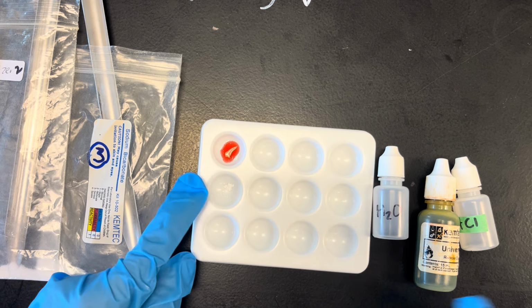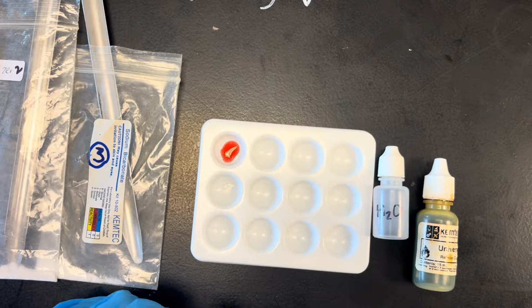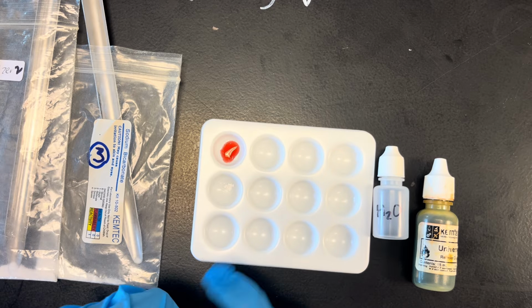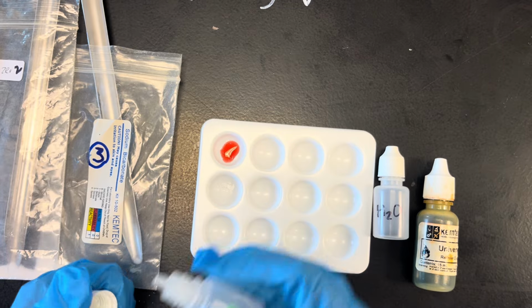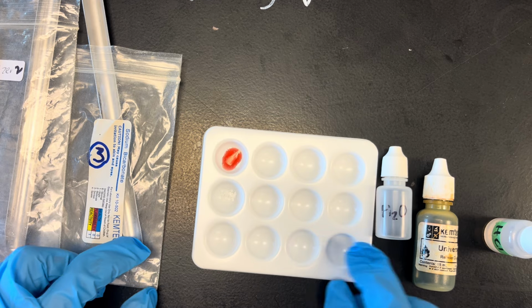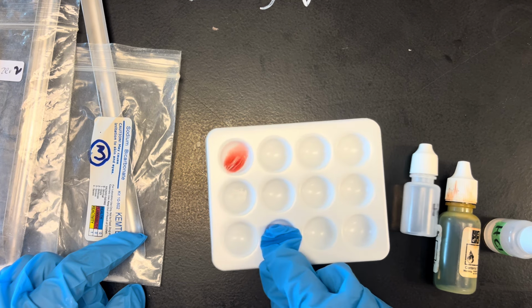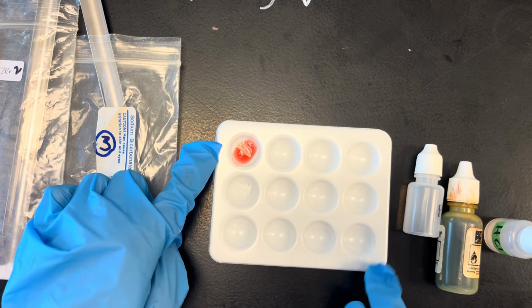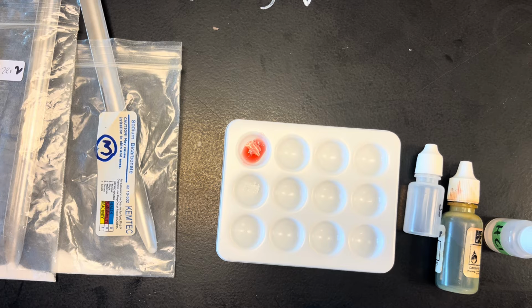And then in the second and final well, you're going to test it with acid. Keep in mind that this is a strong acid. You don't want to get it on your skin or in your eyes. Just going to add 2 drops of acid and see if it reacts. You could also see if it dissolves in the acid. If you need to add an extra drop to check, I don't mind, but this one does not look like it dissolves really well at all, either in the water or the acid. So I'd say it does not dissolve.